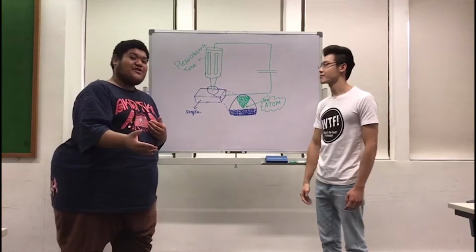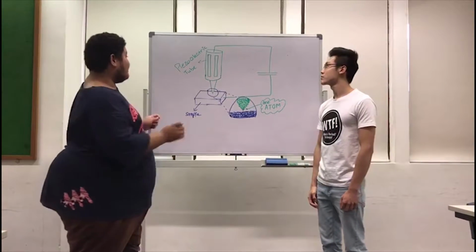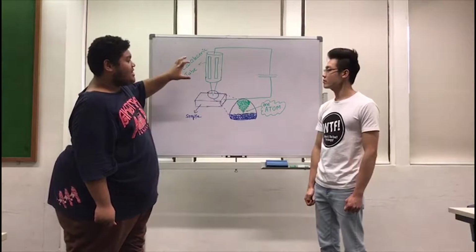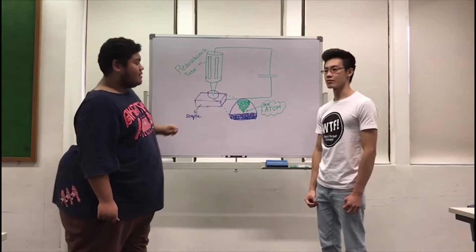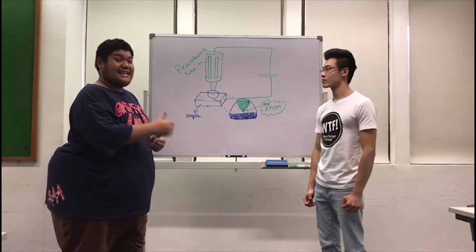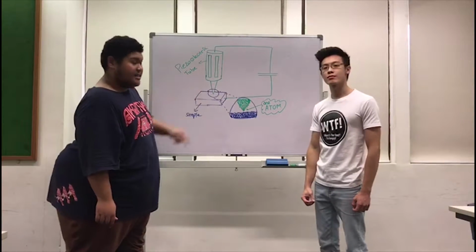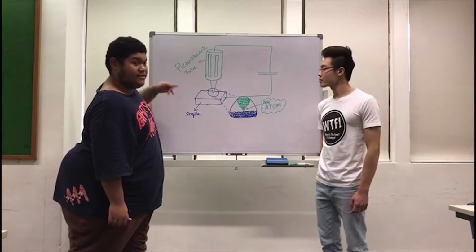All right. So how this works is simple. Just now we had Jorel and Ratna explain to you the quantum tunneling effect and the piezoelectric effect. That takes place here. The piezoelectric tubes basically measure and adjust the probe to whatever height is needed. Now the quantum tunneling effect takes place, but how? Before scanning occurs, a bias is induced here and here, positive and negative or vice versa.